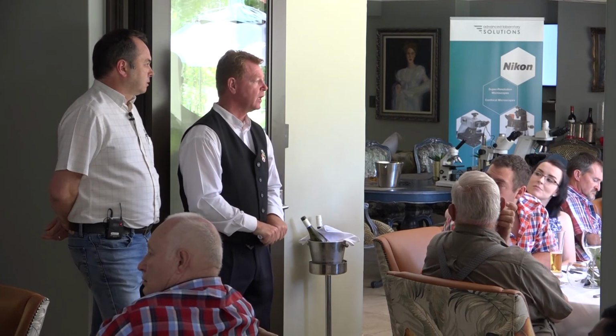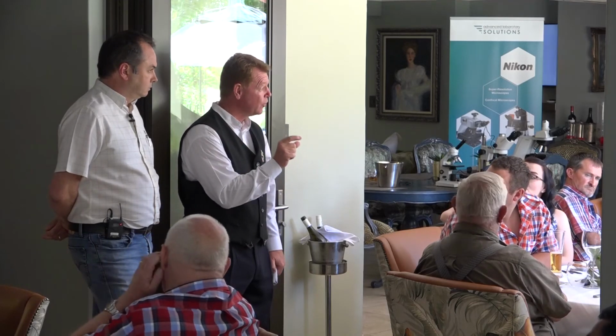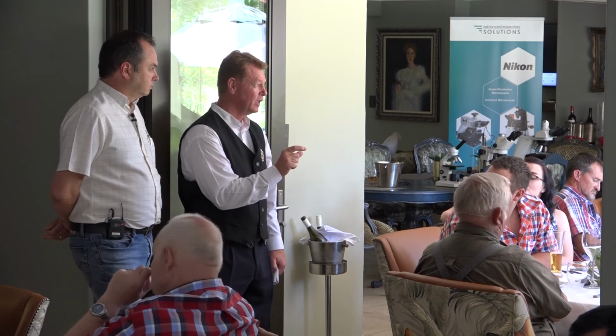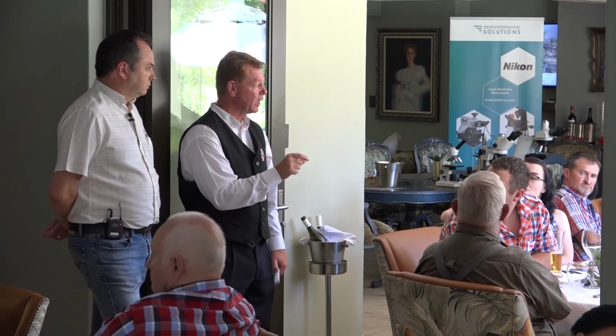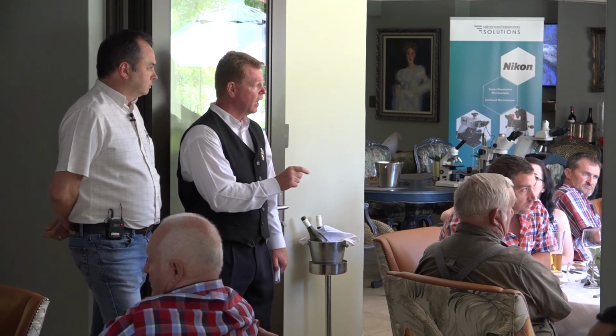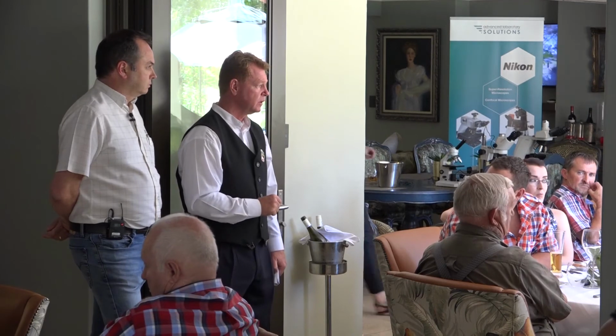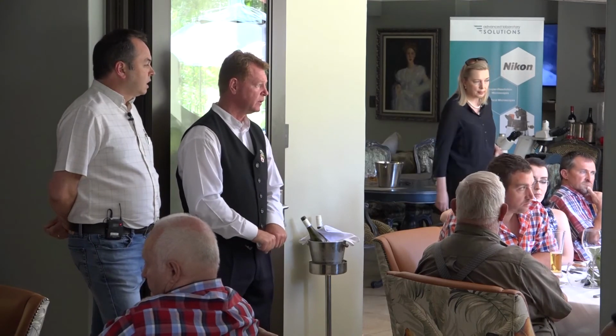Just make sure that if you're in direct sunlight with that slide, it dries very quickly. Then you're going to see nothing. So just make sure that your microscope, the slide at least, is in a shady area. After half an hour? Half an hour, I would not leave it for longer than 10 minutes. I wouldn't leave it for longer than 10 minutes.